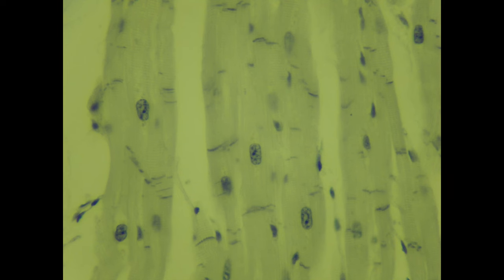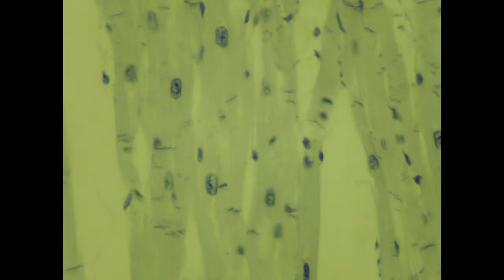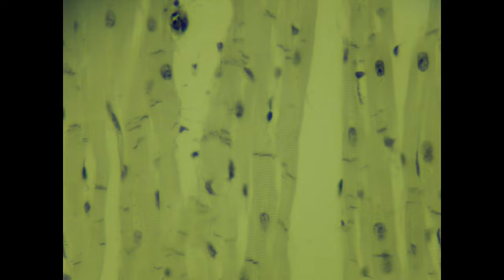I have included here a number of microscopic images, and obviously as one changes the plane of focus, in some sections the striations may be more visible or the intercalated discs more visible. And as one gets closer, it's harder to see an entire cardiac muscle cell.